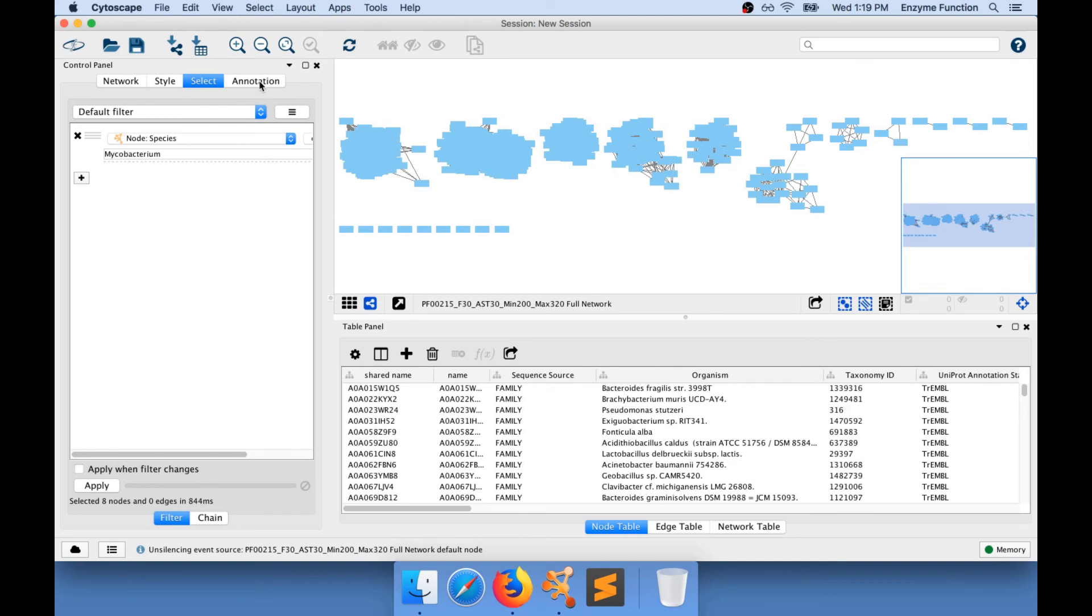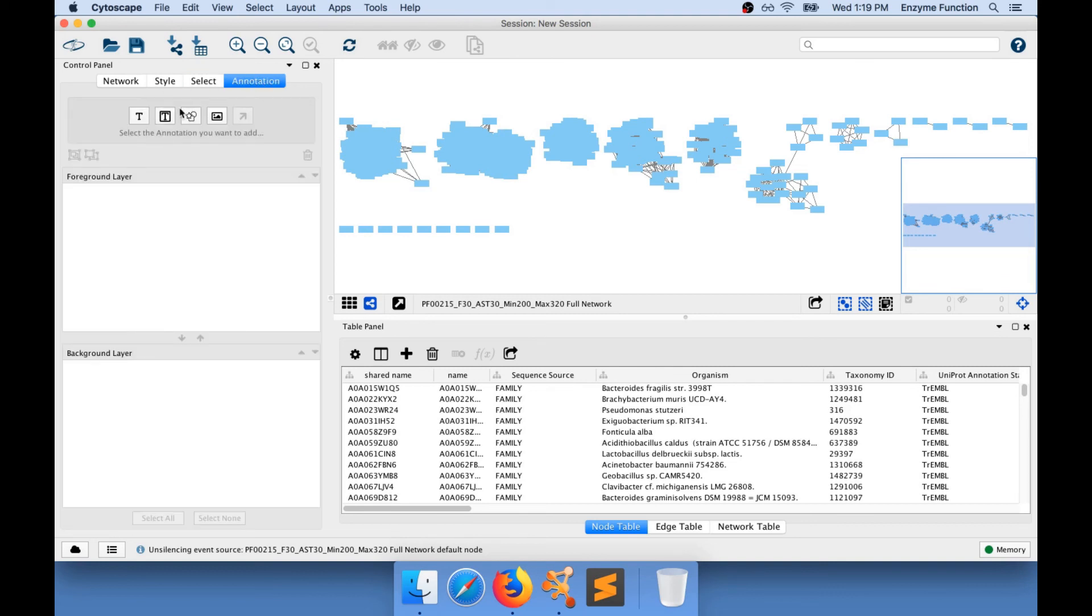In addition, you can add annotations to the network using the annotation panel.